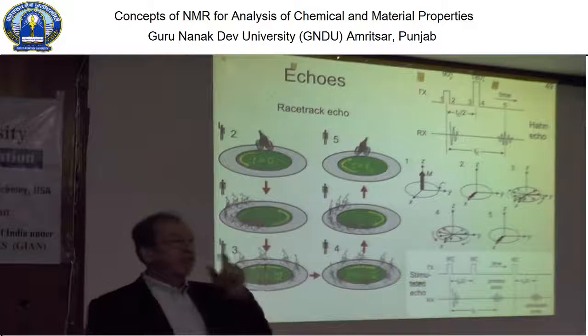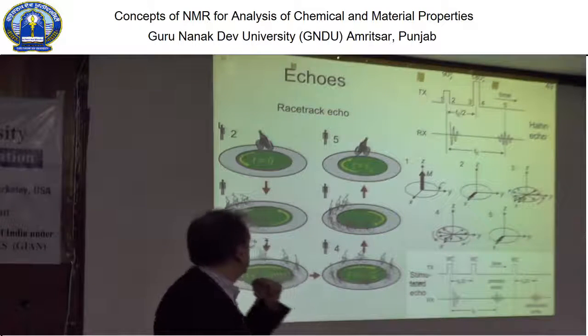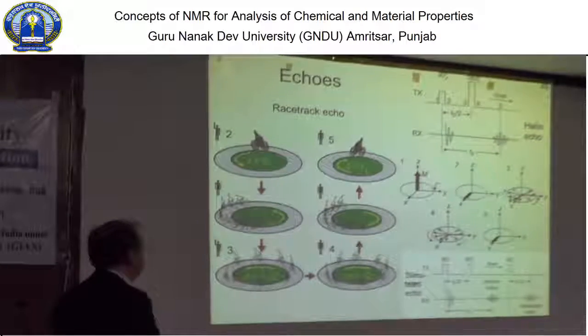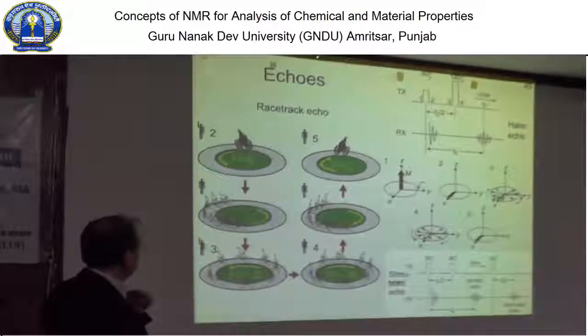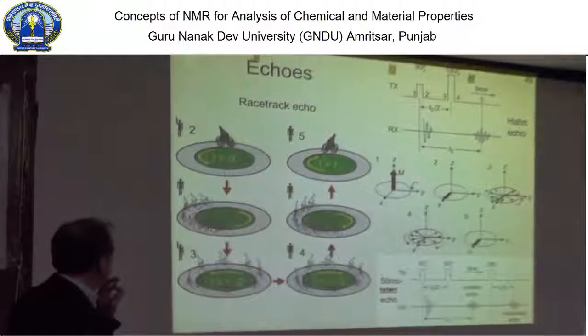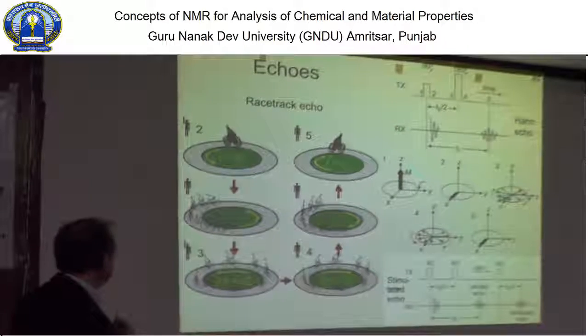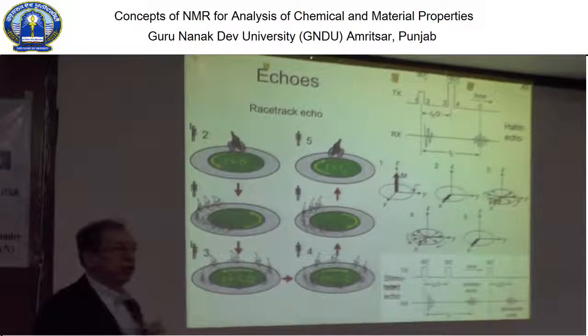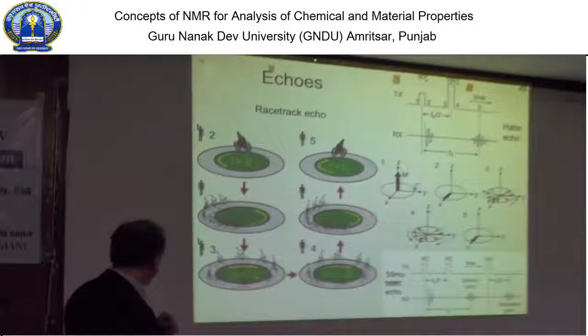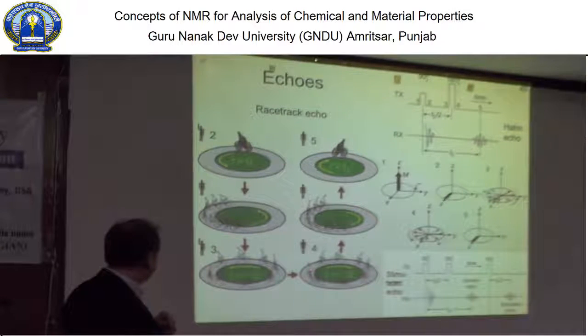And the second pulse is a 180-degree pulse. What the 180-degree pulse does is actually explained here, but I will use an analogy, saying that the 180-degree pulse is equivalent to telling the bicycle riders to change directions and go back. So now you have the same distribution here, but at this moment they all point in different directions.